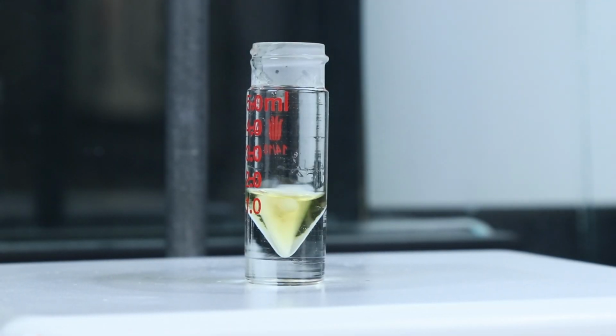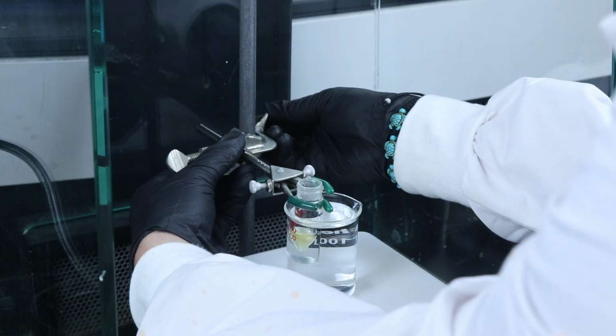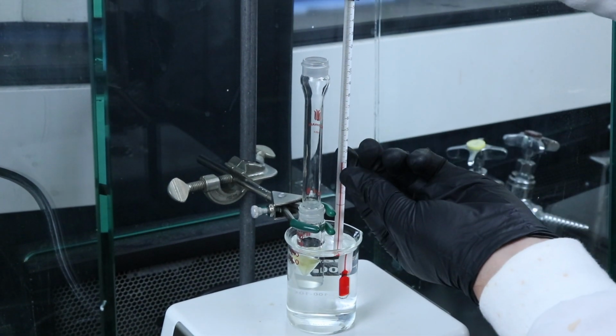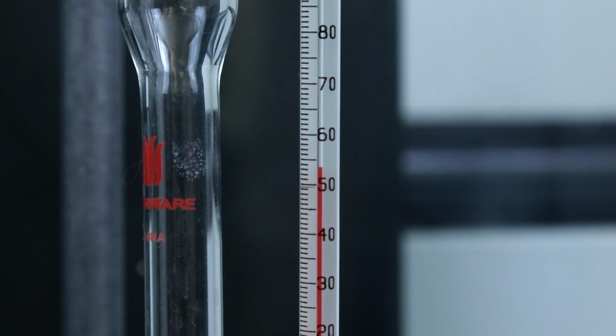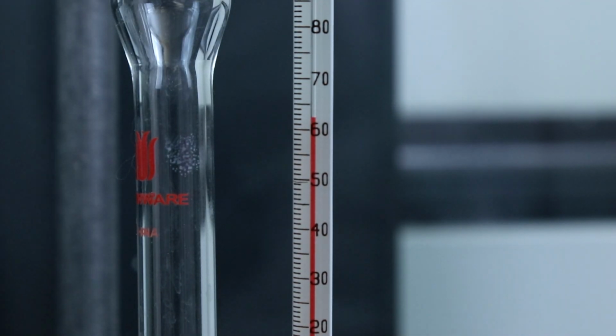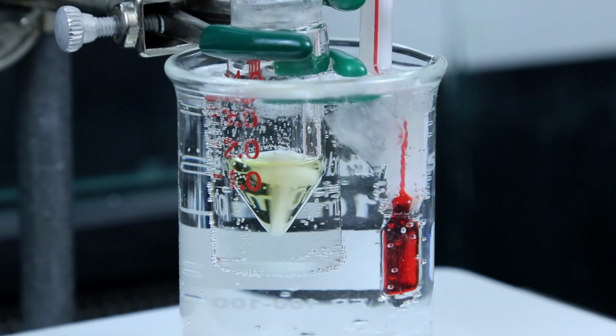So this is kind of what it'll look like once it's ready. And now I'll place it in the water bath and start heating that up, adding the air condenser and the thermometer to measure the temperature. I want to keep it between 60 and 65 degrees, so right around here. But if it ever gets too hot, I'll just add some ice to the water bath to cool things down.